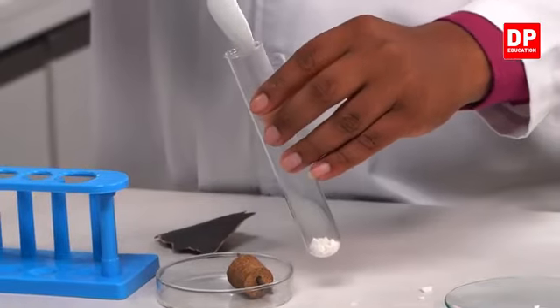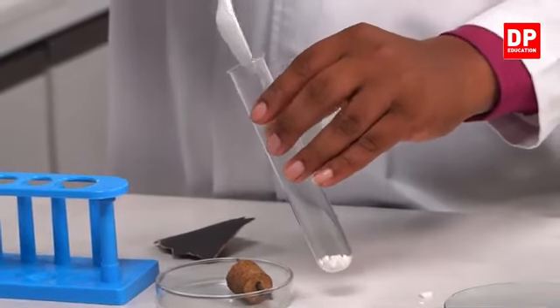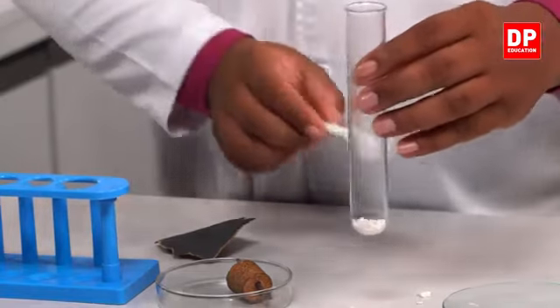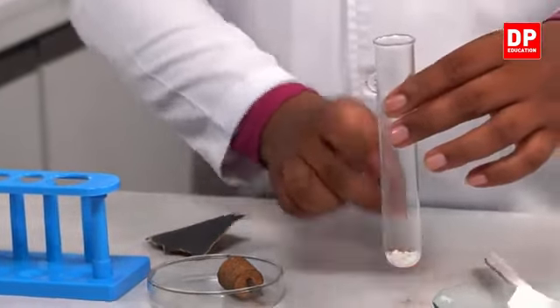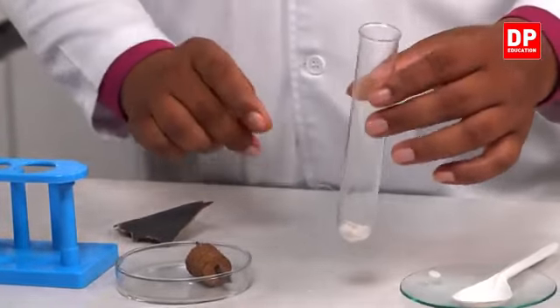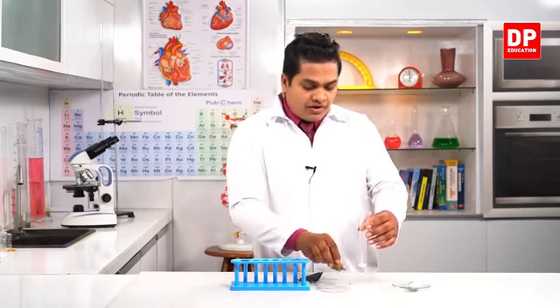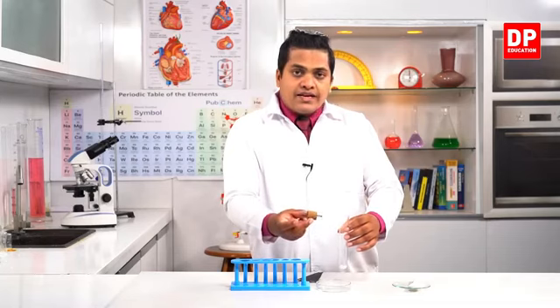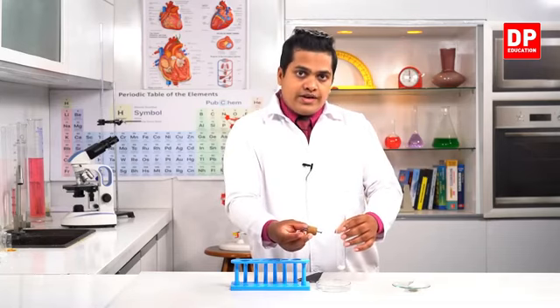So here we go then. I have inserted calcium chloride into the boiling tube. Then after that, I'm going to stopper it very well with this cork that has iron nails.